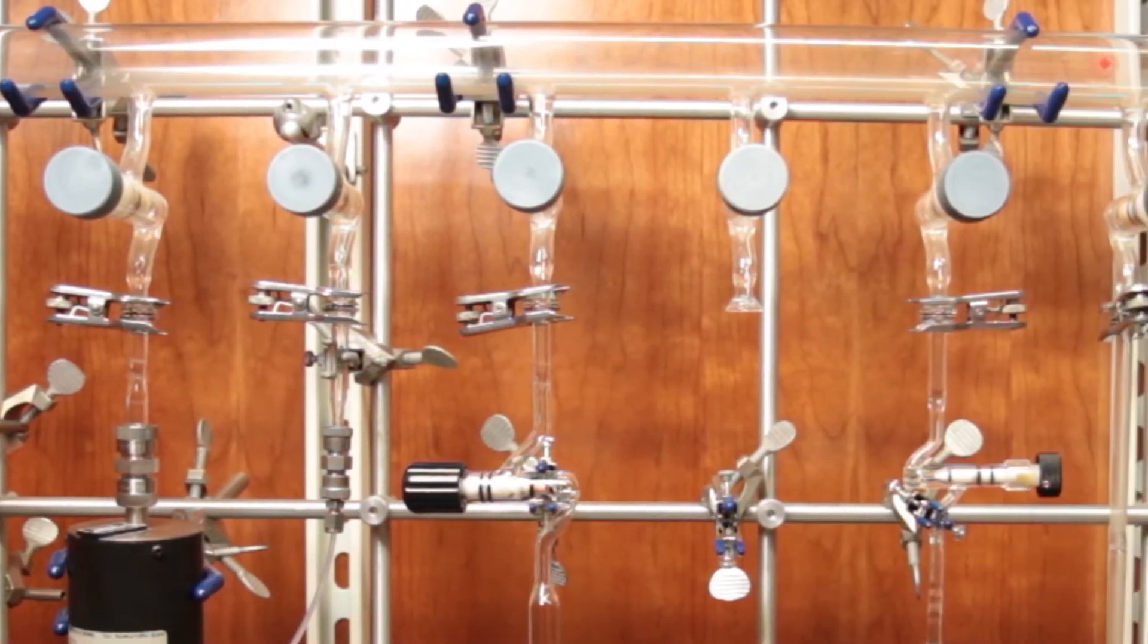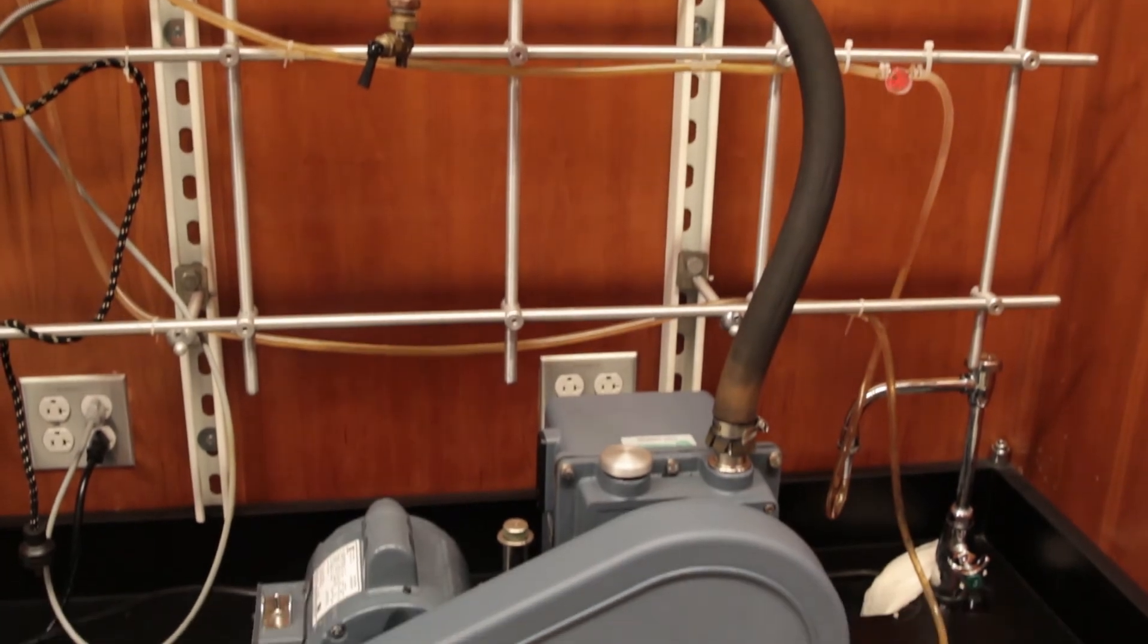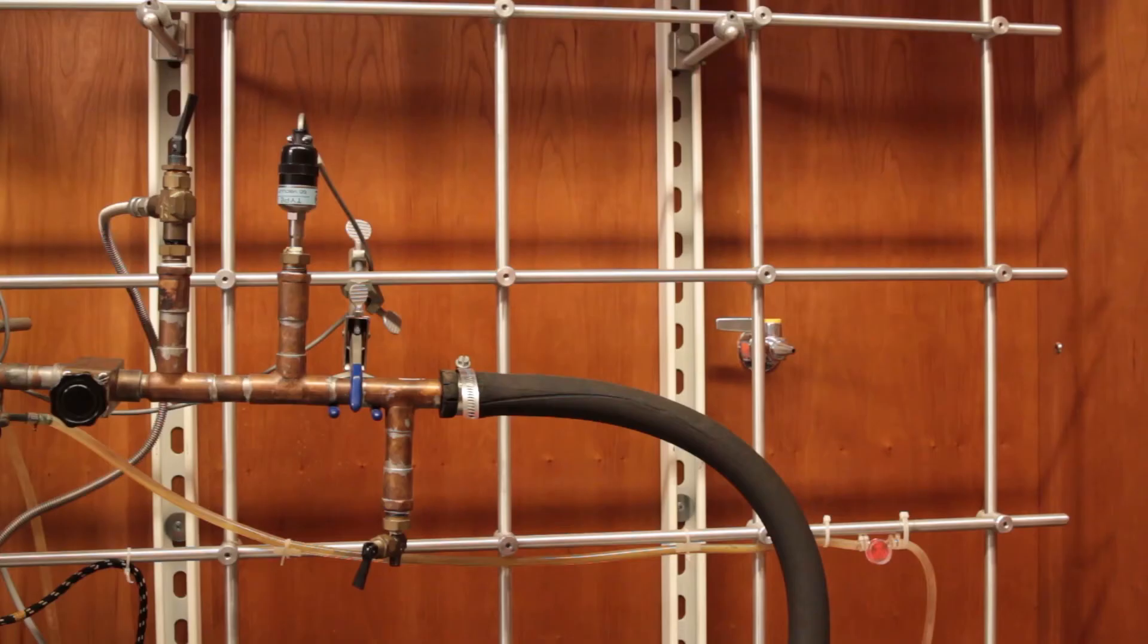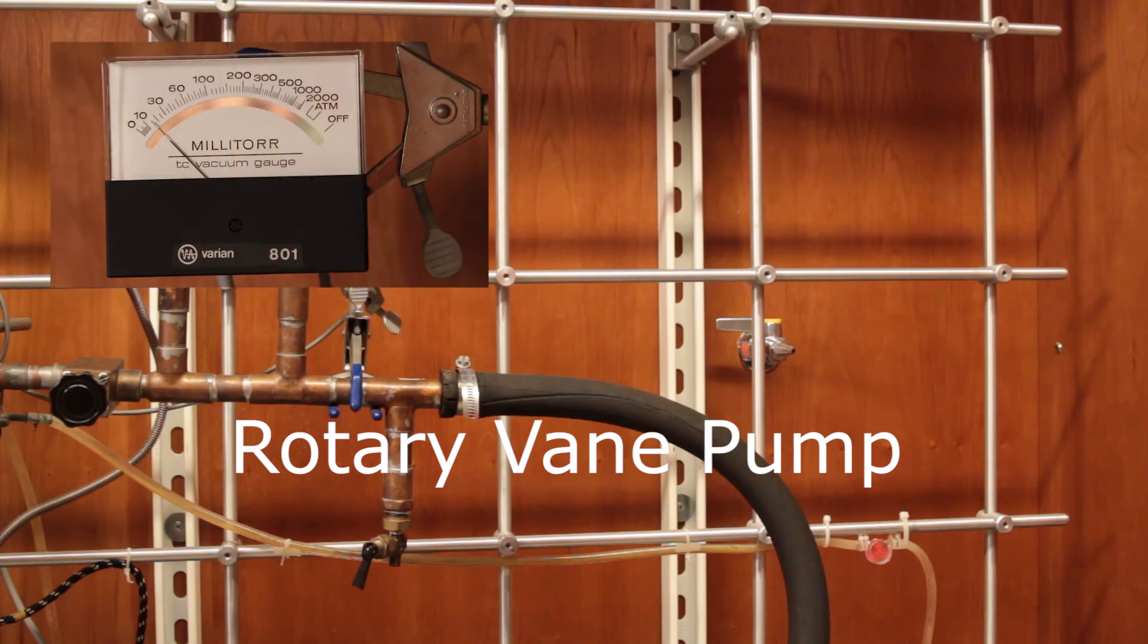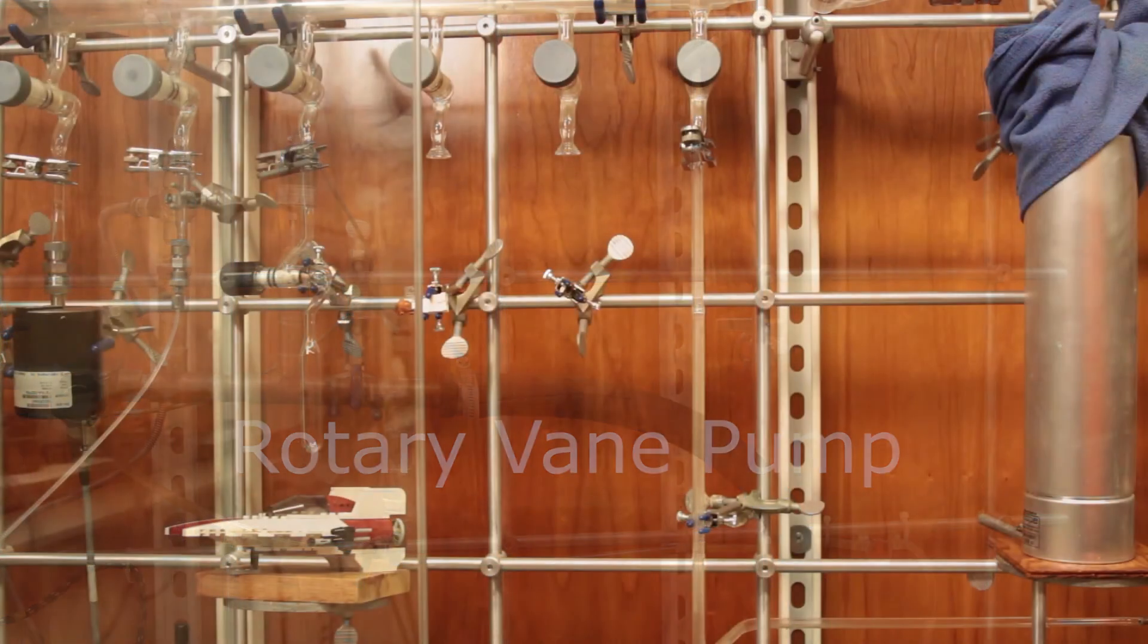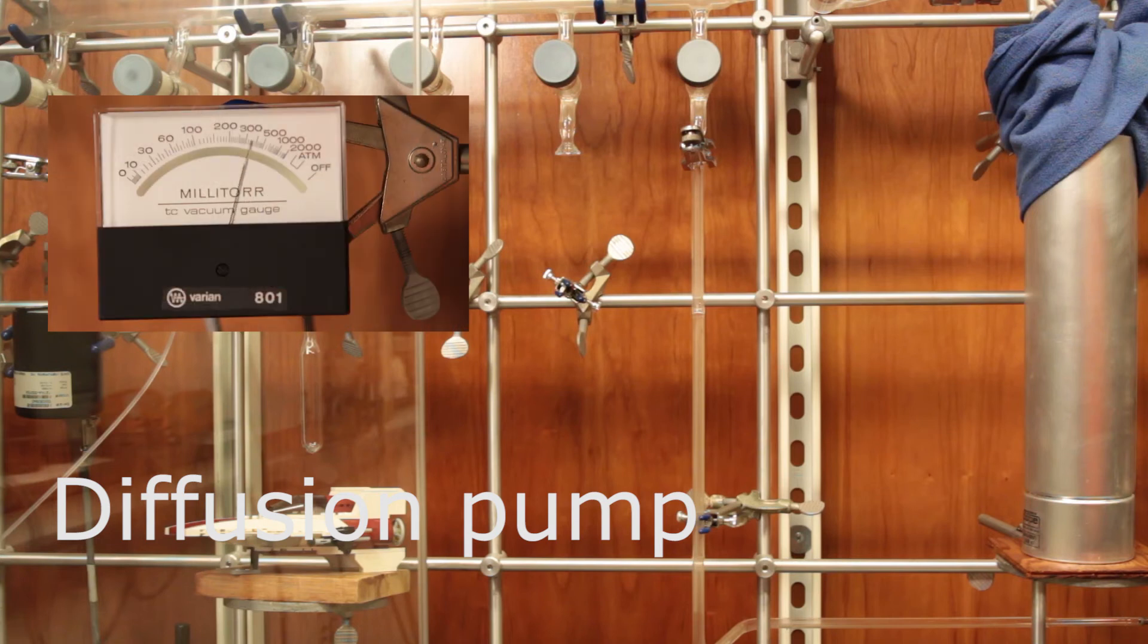This manifold is similar to that used for the HCl-DCl experiment. One significant difference here is the pumping system. As noted, pressure is an important variable in this experiment. The pumping system on this vacuum line is designed to achieve pressures less than one thousandth of a millitorr. The vacuum system uses two pumps in series. The first pump, the same type used to evacuate the HCl-DCl cell, is called a rotary vane pump. It lowers the pressure inside the system to less than 10 millitorr. Rotary vane pumps are very common and are the usual lab workhorses. The second stage pump is called a diffusion or gas jet pump. This pump only functions when the pressure inside the system is less than 100 millitorr. In other words, we need the rotary vane pump to lower the pressure sufficiently for the diffusion pump to function.